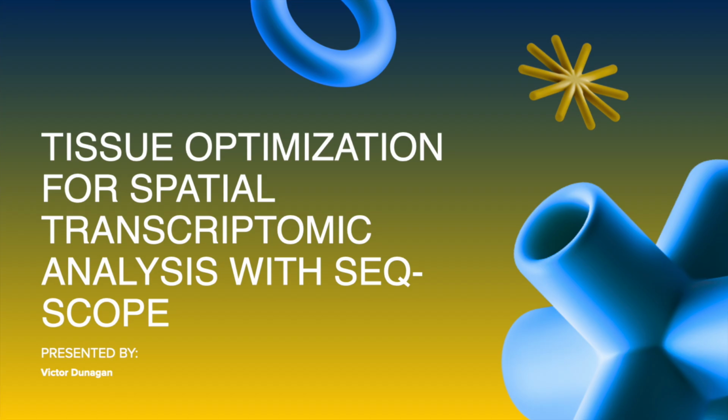Hi, my name is Victor Dunagan. This summer, I had the opportunity of interning in the SenNet CUSP internship program at the Lee Lab at the University of Michigan. And the title of my project is Tissue Optimization for Spatial Transcriptomic Analysis with Seq-scope.